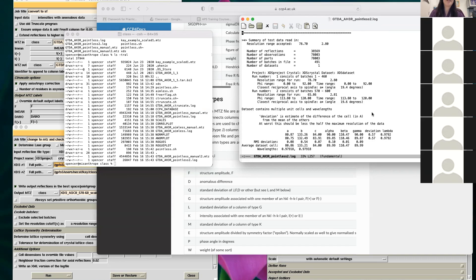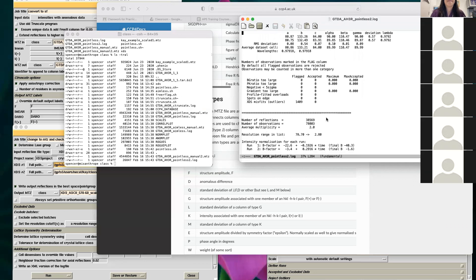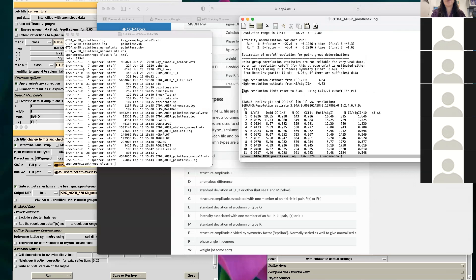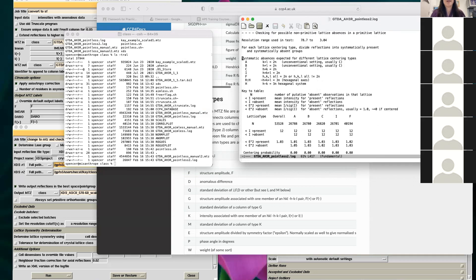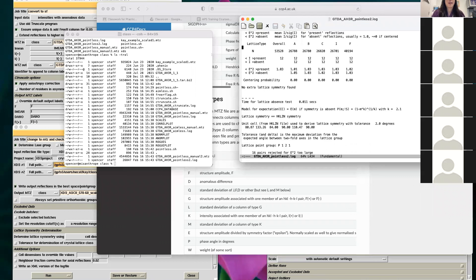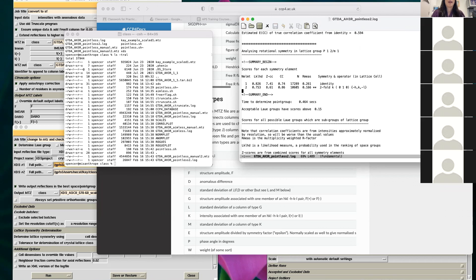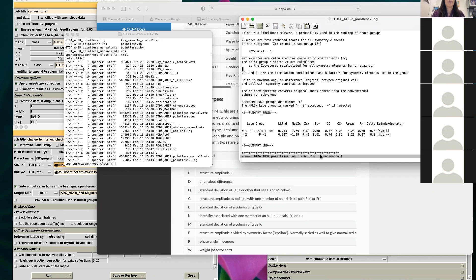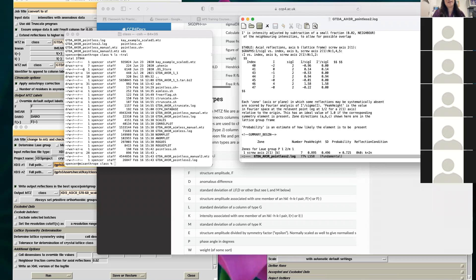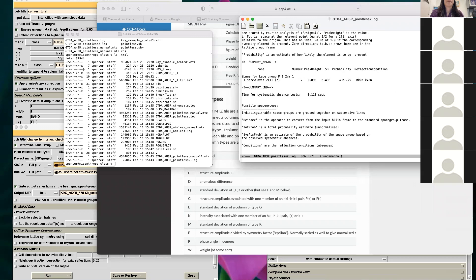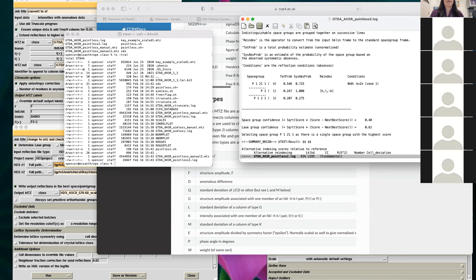You can add numbers to your batches if two sets use the same image numbering — those options are all in the keywords. Pointless then goes through checking resolution and determining the space group again. You can see that the likelihood numbers have gone up because I tossed the bad images — P1 is much less likely and P2 is far more likely now.